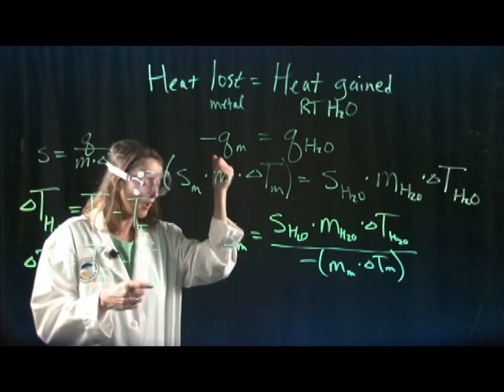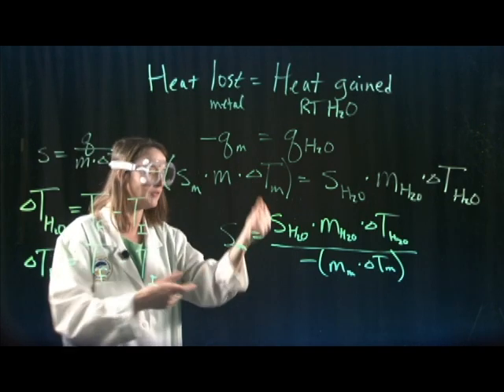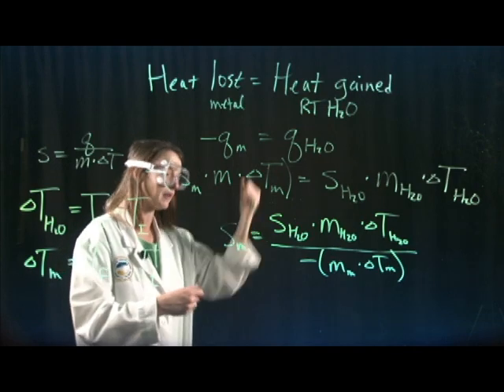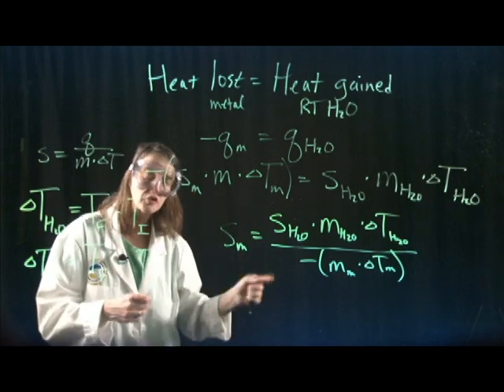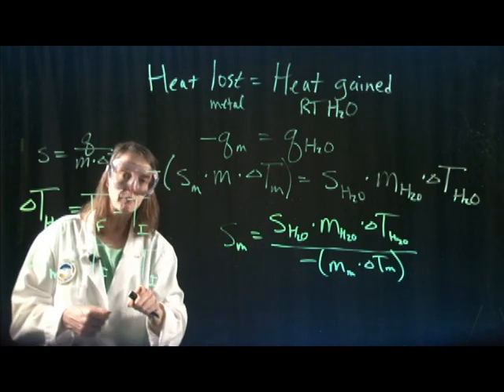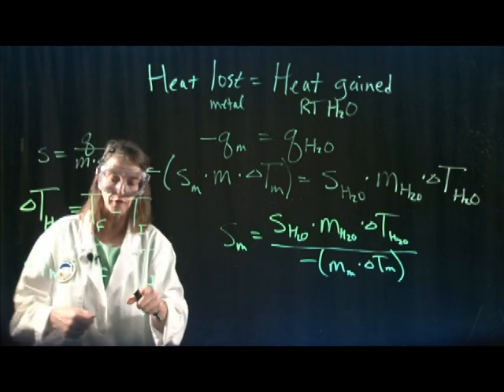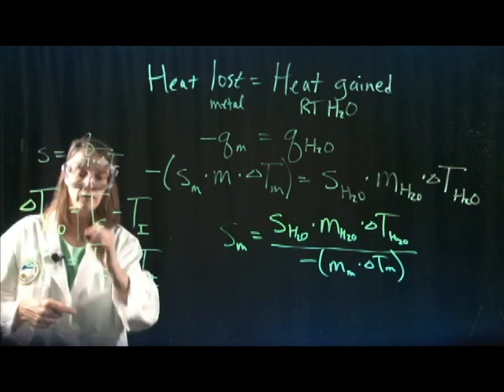So you're not measuring the temperature of the boiling water bath, because if you did that, you would have to wait for it to cool back down and it might mess up your experiment, because now the temperature probe itself would be hot. So we're just going to assume that the initial temperature of the metal is 100 degrees Celsius, same as boiling water. The final temperature is the same for the whole system.